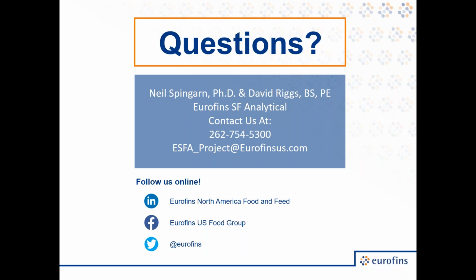So what's the most common? Everything is common. You'd be astounded at the things we find as contaminants in food products. Everything from salamanders to drugs to minerals, just amazing things.